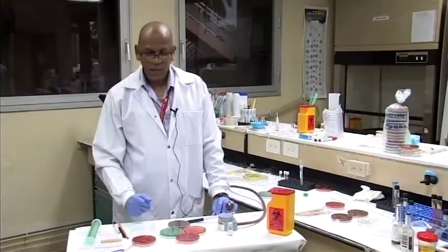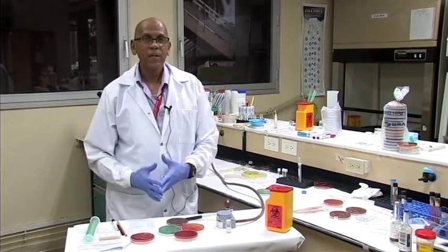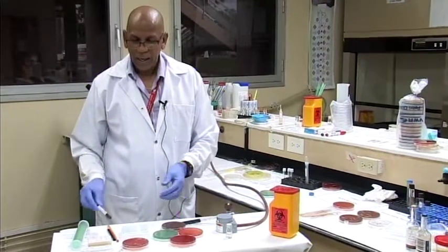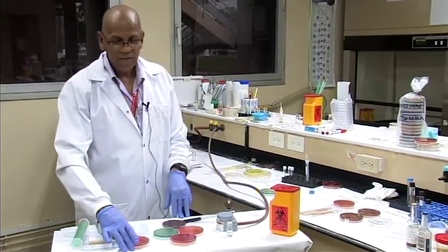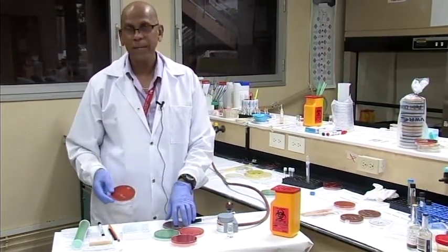In our demonstrations, we're going to demonstrate now how to perform a culture in the microbiology lab. Now you can have cultures of various specimens. For example, you can have a throat swab, a skin swab, wound swab, etc. come into the lab to perform a culture. Or you can have bacteria that was previously cultured and streaked on agar plates that you want to do a subculture onto fresh agar plates.